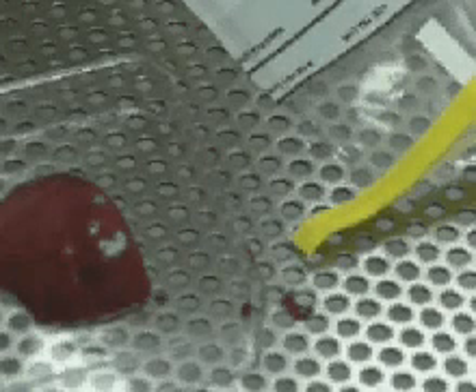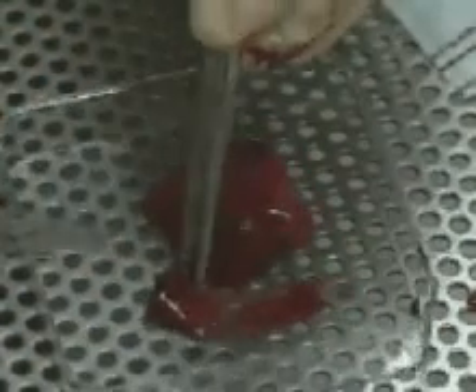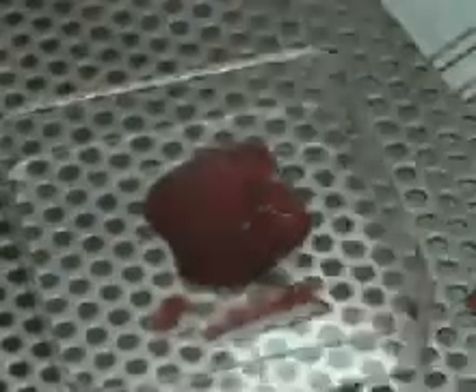The liver can be placed in a petri dish or put in an aseptic bag to be sent for culture. In addition, a small piece of the liver can be excised and placed in formalin for a histopathologic examination.